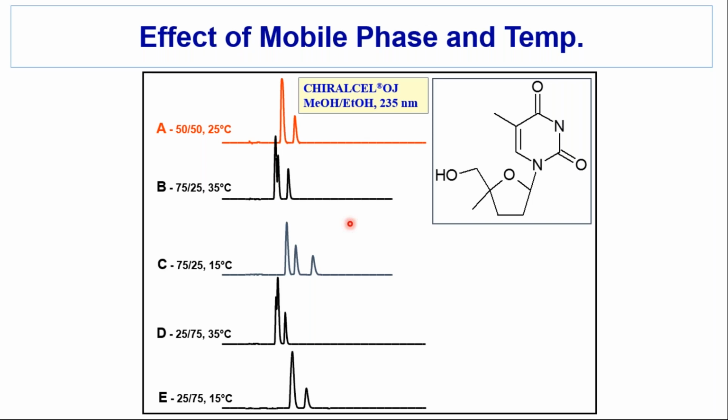This is separation of this diastereomer. So I have four peaks. And screening, I got several separations, but I like this one because the peaks were fairly sharp. So I thought I would try to do the separation on this column with this mobile phase. Unfortunately, in the screen with 50-50 methanol ethanol, I got one of the enantiomers resolved from the other three.